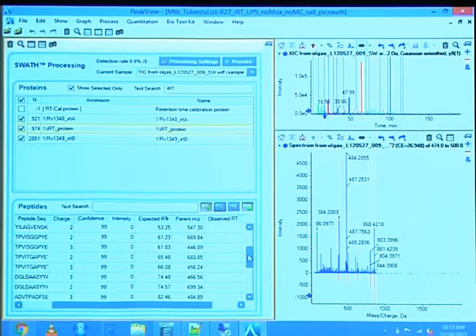What you can see now is, that one has 15 minutes, and all of them have a value in there. So we should be good to go. Now all the peptides in there should actually have an expected retention time.